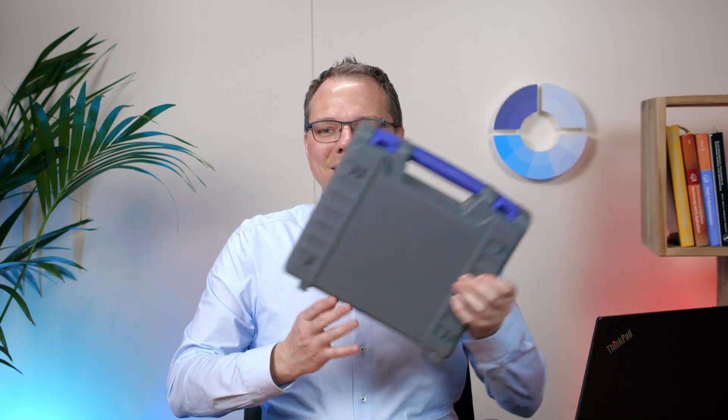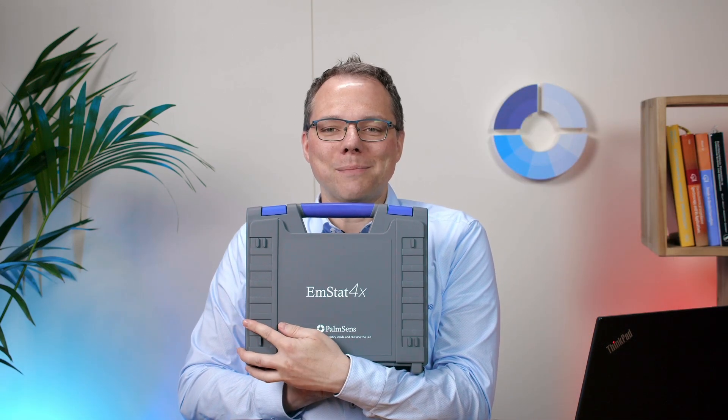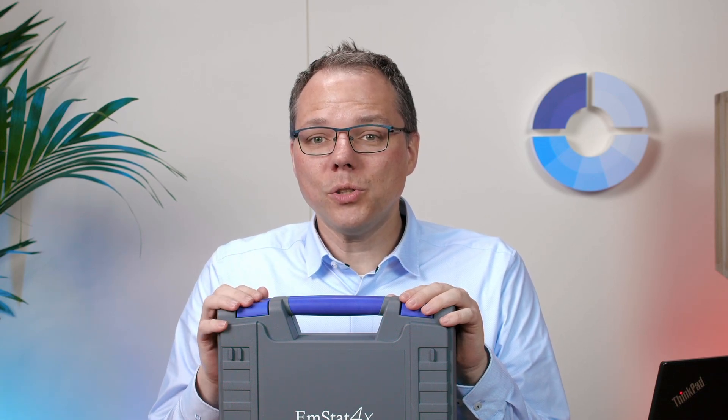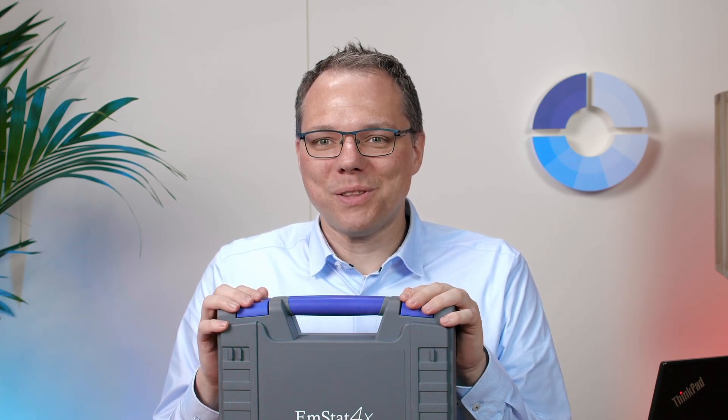Hello and welcome to this Palmsense unboxing video. I'm Lutz Stratmann and today I would like to show you what you get when you buy an EmStat 4X. Let's immediately have a look into the box and afterwards we're going to do our first measurement with the EmStat 4X. What do we find in the box?